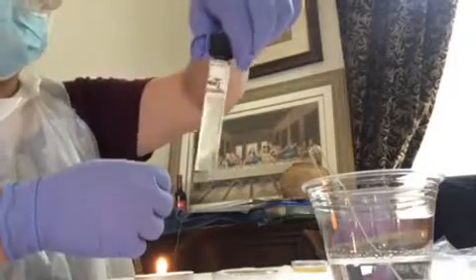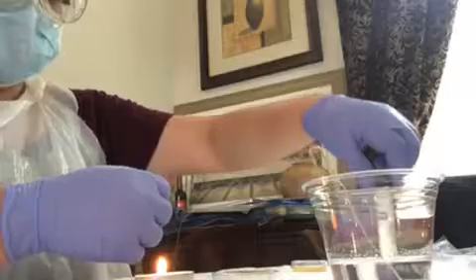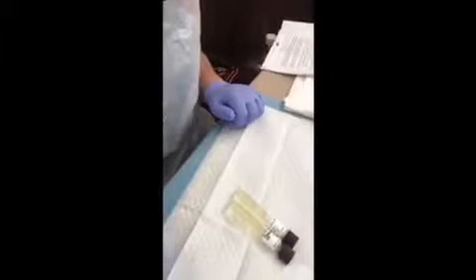Okay, so we're just going to store it now. And I'm going to recheck it after 48 hours.